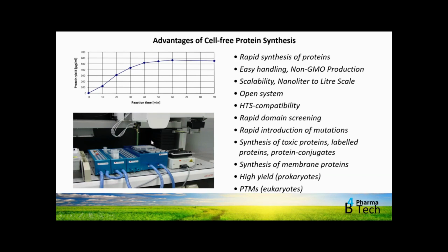Now, this is an essential prerequisite, for example, for the design of enzymes and mutational analysis of enzymes. Artificial intelligence in combination with enzyme design is an excellent application for such a fully automated production of enzymes in this robot. Now, we are devoid of the production of any genetically modified organisms as long as we do not use a plasmid prep prior to the cell-free protein synthesis and as we directly spike in the DNA.